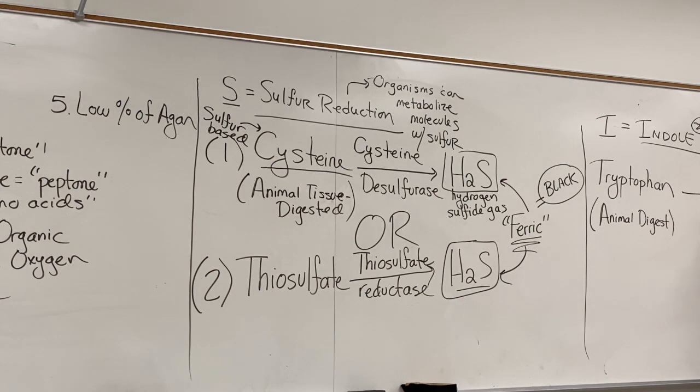So they have to have an enzyme called tryptophanase, so that they can hydrolyze tryptophan. So when they do that, they can basically use it as like a food source. So if they break down the tryptophan, they'll actually end up with pyruvate as an end product.